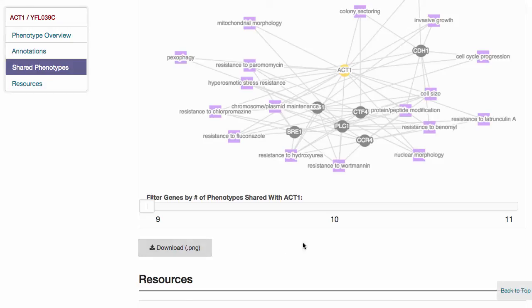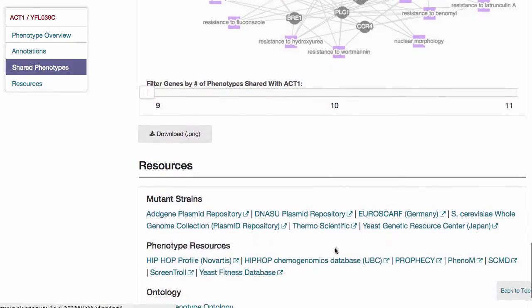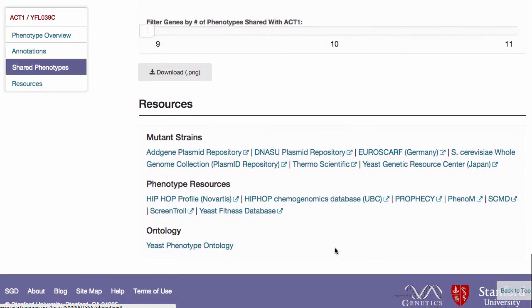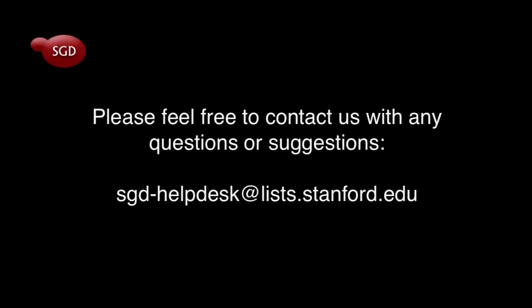Below the shared phenotypes network diagram, you can find resources external to SGD that are relevant for the S288C mutant strain and phenotype information. Where possible, links lead to information in other databases about the specific gene of the page.